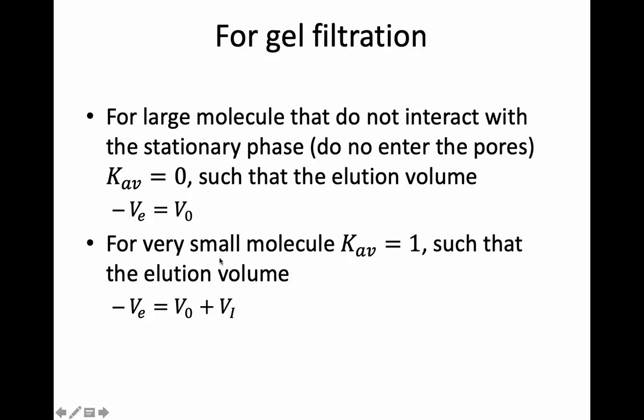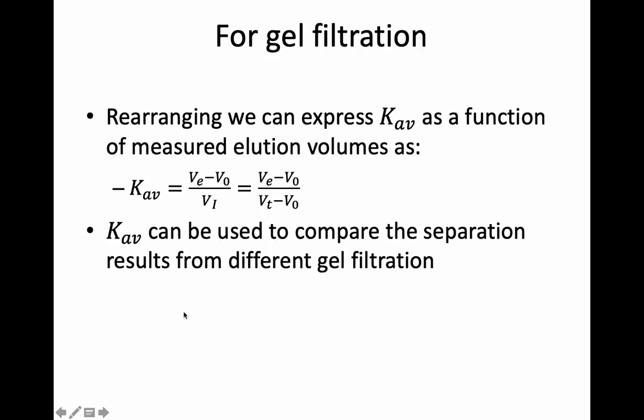Instead, for very small molecules that are basically stuck in your pores, KAV is equal to 1. So your elution volume is just the sum of your volume of pores and your void volume, right?